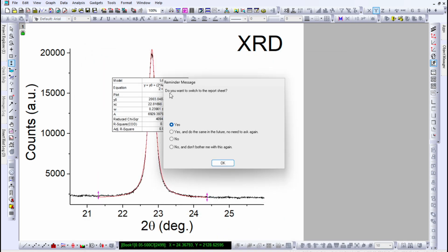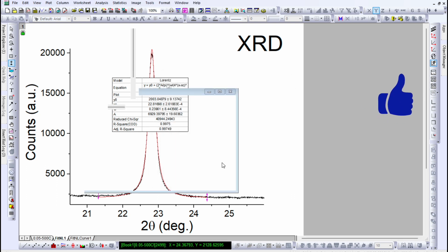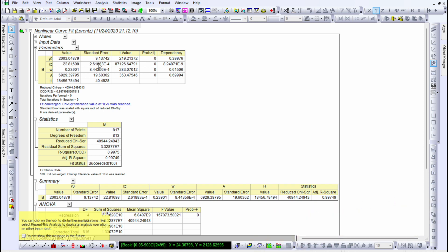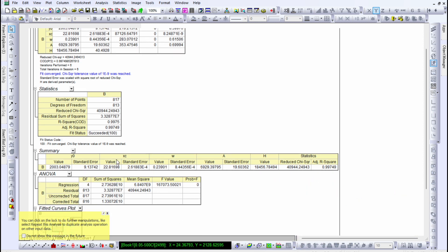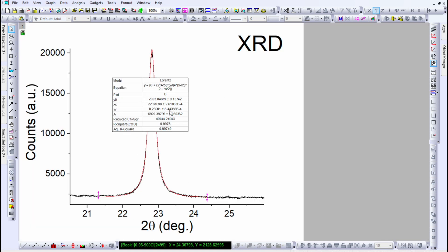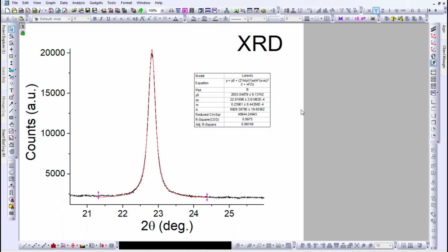Click Done and it will ask if you want to switch to the report sheet. If you click Yes, it will show you the report, which includes y0, xc, w, A, and H with their respective error bars. If you want to see the fitting curve, go to fitting curve one — you can see a fitted curve plot, a histogram of the residuals plot, and a residual vs. predicted value plot. You will also see a short summary of y0, xc, w, and A with error bars.